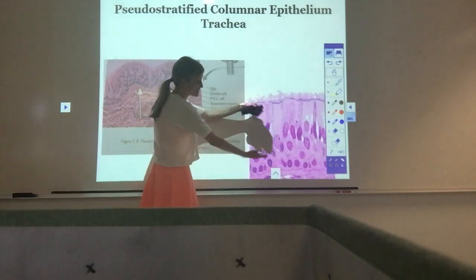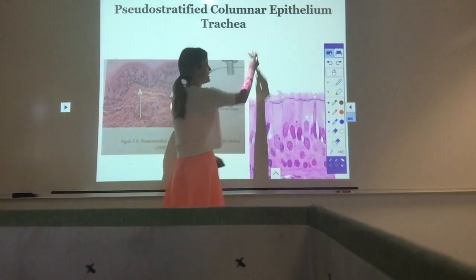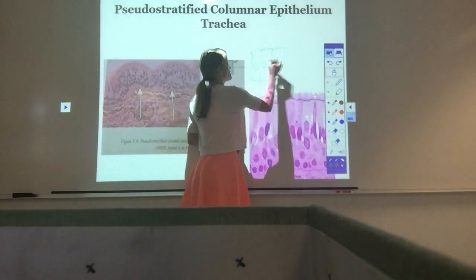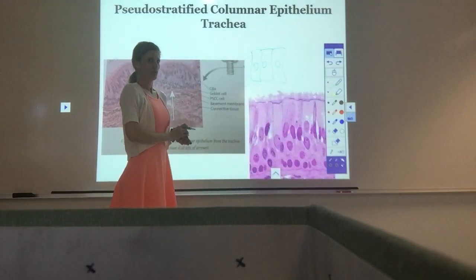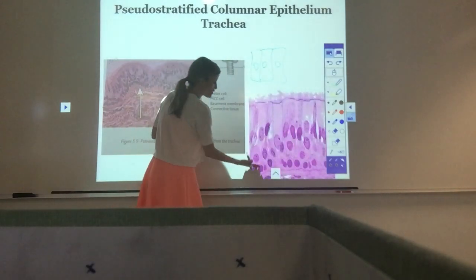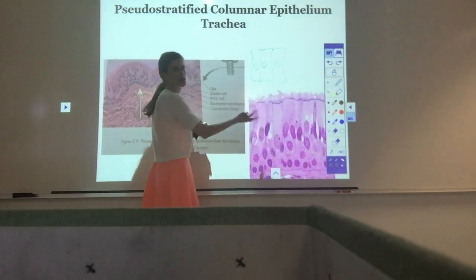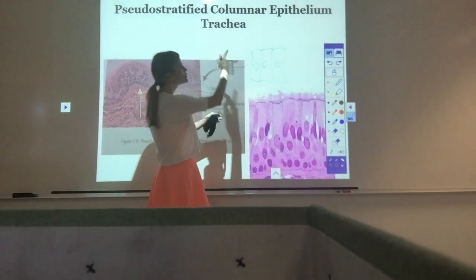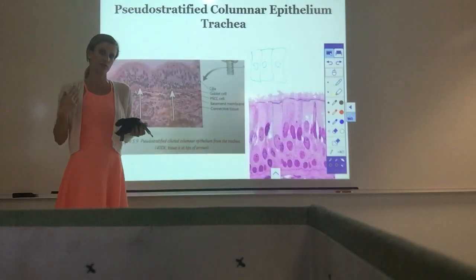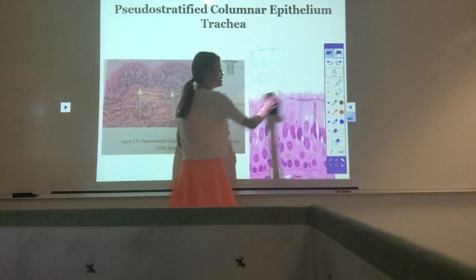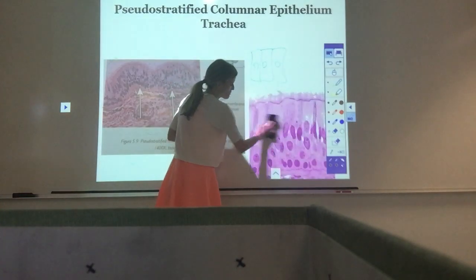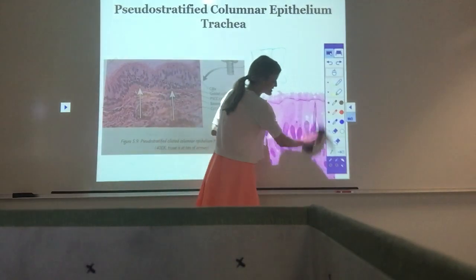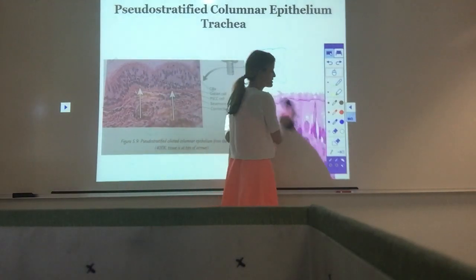You can tell it's pseudostratified because the nuclei are all at different levels toward the bottom. If it were simple columnar, the nuclei would all be in a row. We'll see another type where the nuclei go all the way up to the top — that's transitional epithelium. So the key: nuclei in the bottom two-thirds = pseudostratified ciliated columnar; nuclei straight in center = simple columnar; nuclei all the way to the top = transitional.